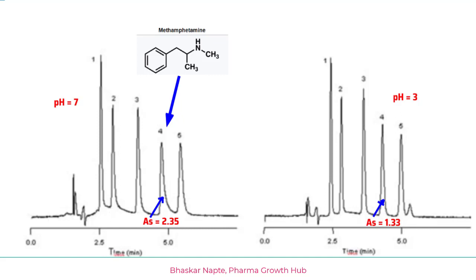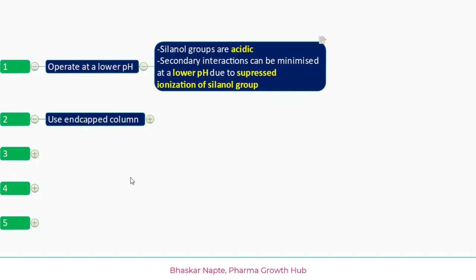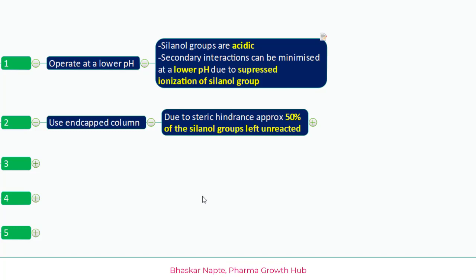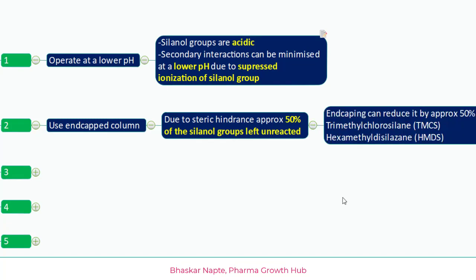The second solution is to use an end-capped column. The reason for secondary interaction is the availability of unreacted silanol groups, and these silanols are available because of steric hindrance — your C8 or C18 chains cannot replace 100% of the silanol groups, so approximately 50% remain unreacted on the stationary phase. Since C8 or C18 are bulky molecules, they cannot react with all silanol groups.